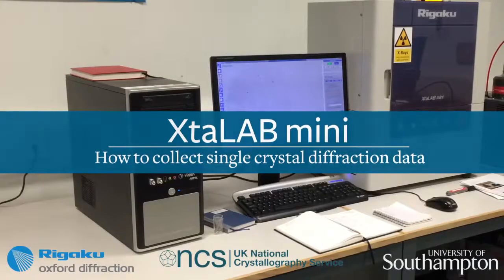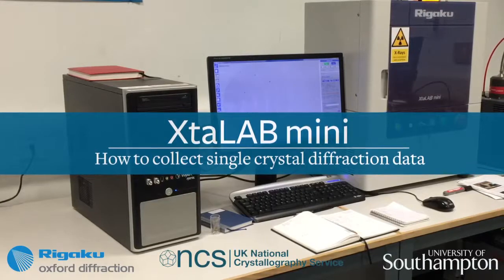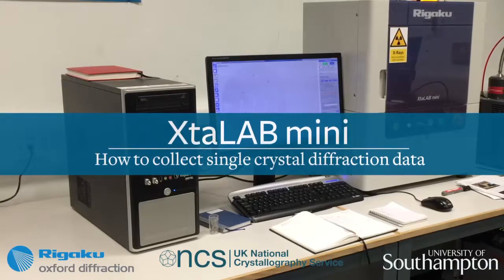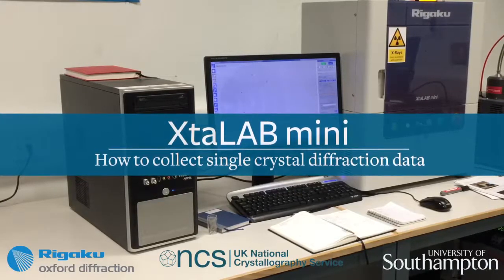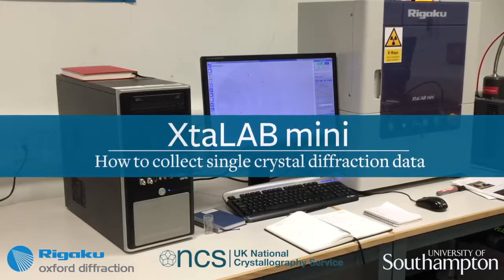Over the next few minutes, we will introduce the Rigaku XtalLAB mini diffractometer, which is used to conduct single-crystal X-ray diffraction experiments. From a single-crystal X-ray diffraction experiment, one can obtain the three-dimensional structure of a particular chemical compound.